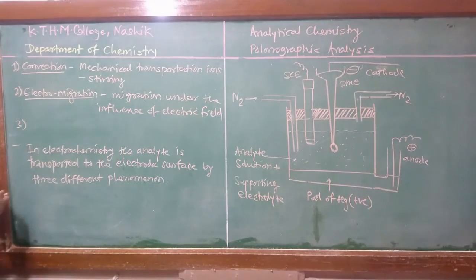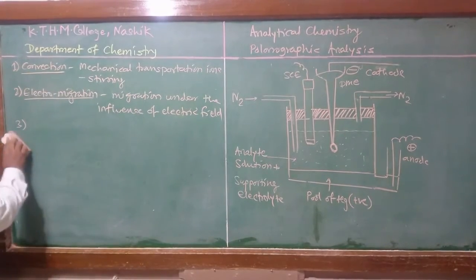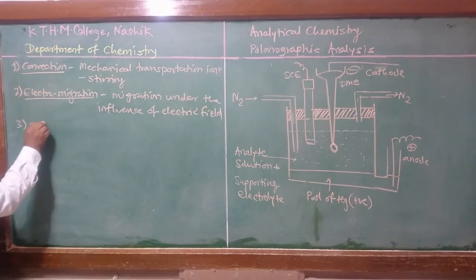The third type of phenomenon that transports the ion to the electrode surface is called diffusion.